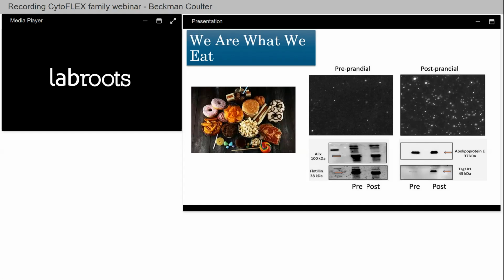You can see from our lane changes here, or our intensities, certain markers for your extracellular vesicles change, and certain markers for contaminants, such as the apolipoproteins, change. So you can get confused, or, if you're new to the field, you're unable to assess what is a particle of interest and what is not.